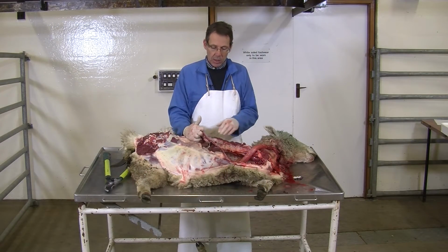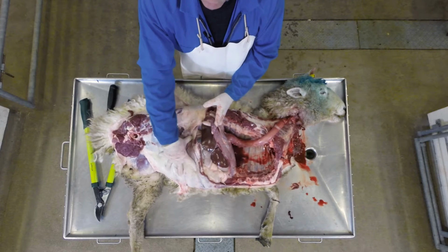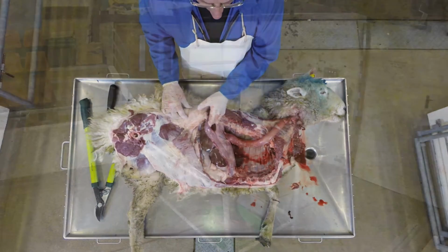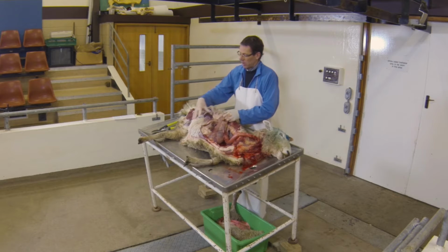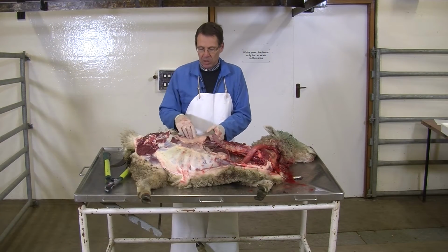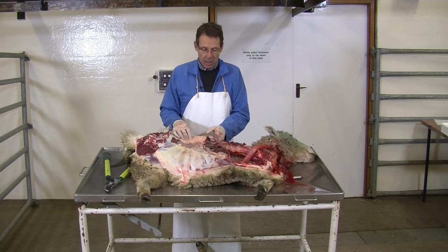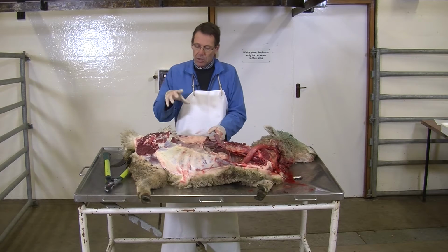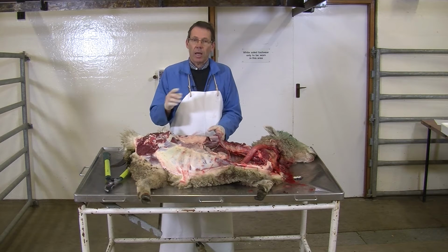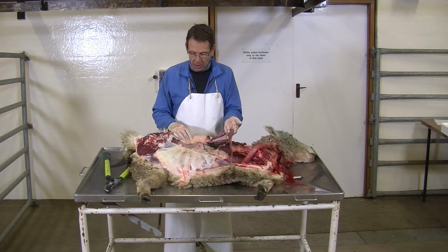So, done the chest, now we're going to move back to the abdomen. Nice, it's a soft container here, not like the rigid container for the chest. So this allows for the expansion, and being a ruminant, they tend to have quite a large abdomen because the animal is carrying around a large amount of food. So we're going to find the stomachs in here, small intestine, and organs such as this one here, which you can see already with the liver.